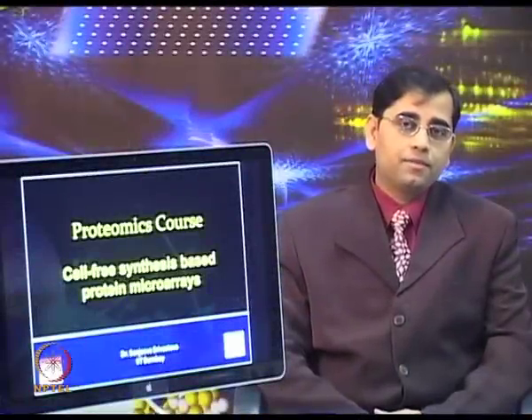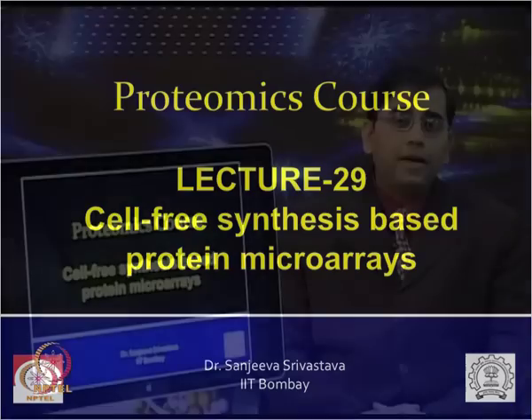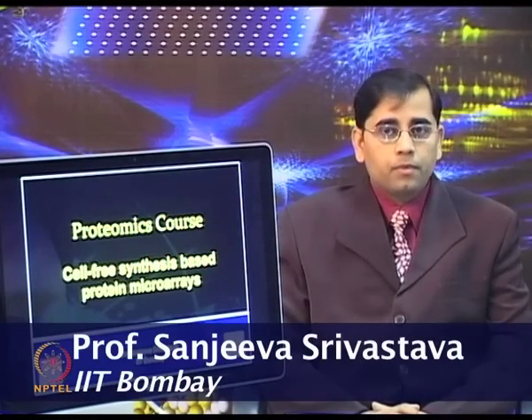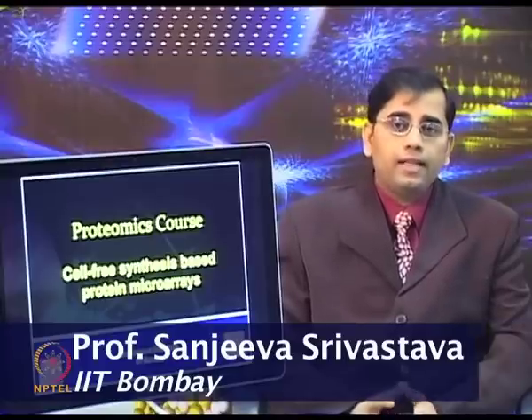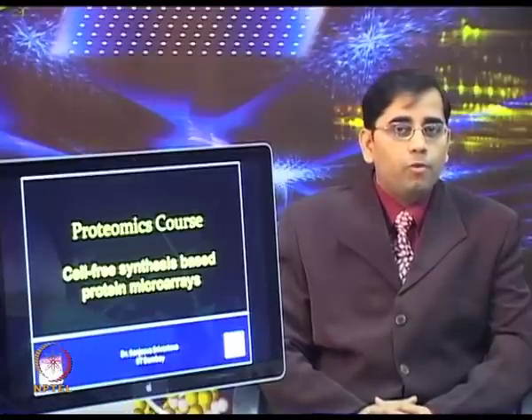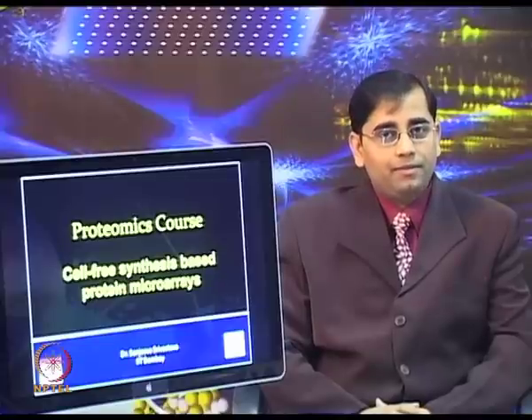In today's lecture, we will talk about microarrays which are based on cell-free synthesis. So, cell-free synthesis based protein microarrays. The microarrays provide a high throughput versatile platform for large scale analysis of functional proteins. These microarrays are used for various applications, for example, antibody profiling, biomarker discovery, enzyme substrate identification, protein-protein interaction, etc.